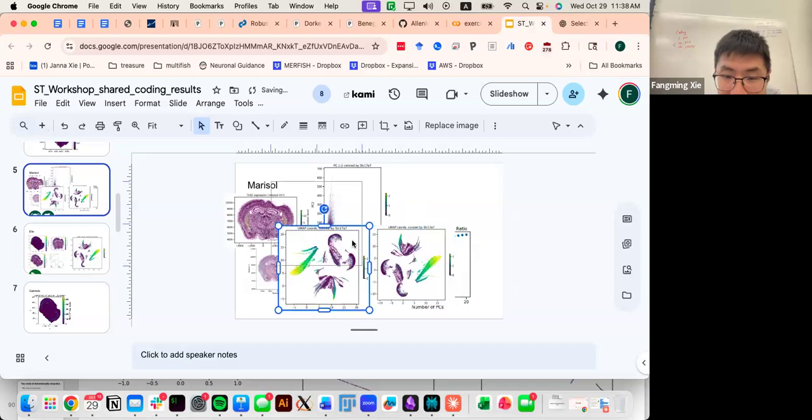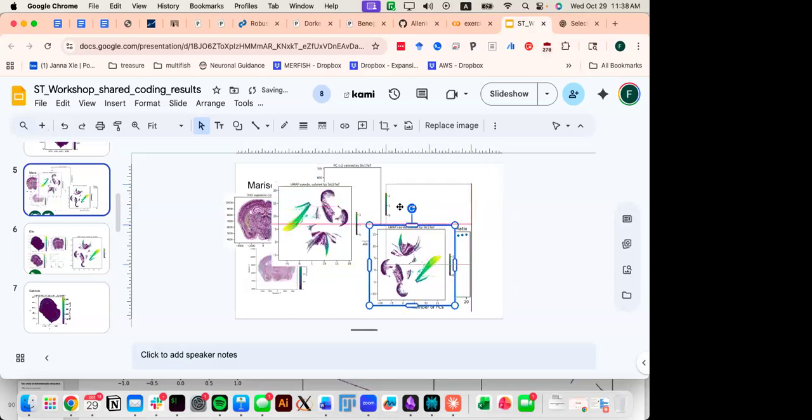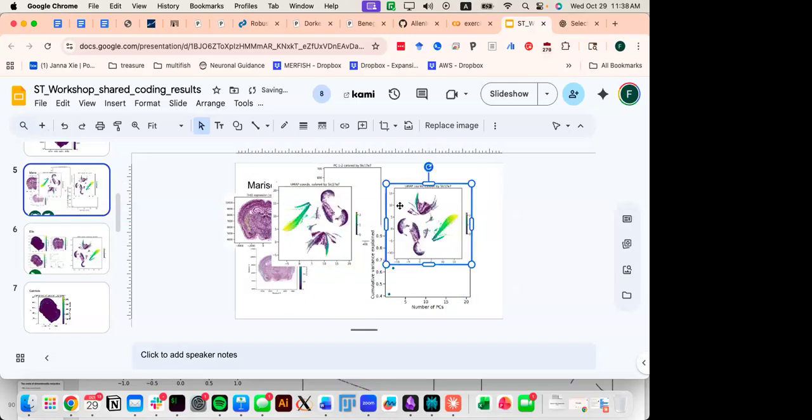I'm not sure what was completely different, but it basically looks rotated, and I'm not sure what would cause that. Do you have an idea of what I may have done?